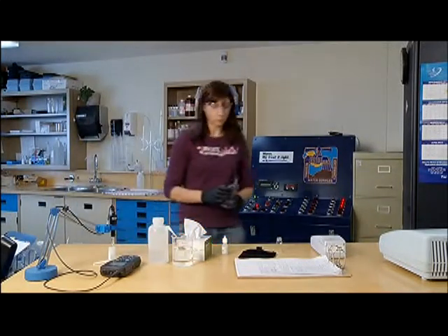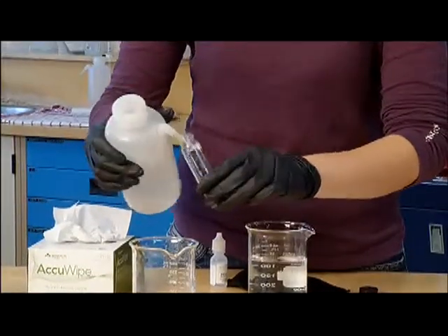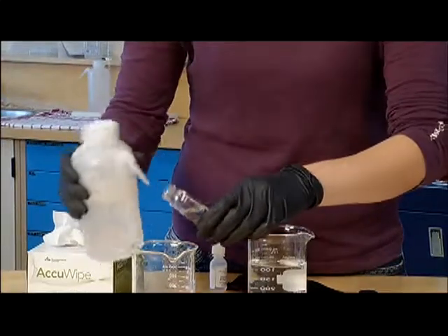Move to the testing area. Rinse the sample bottle with lab-use approved ultra-pure water.